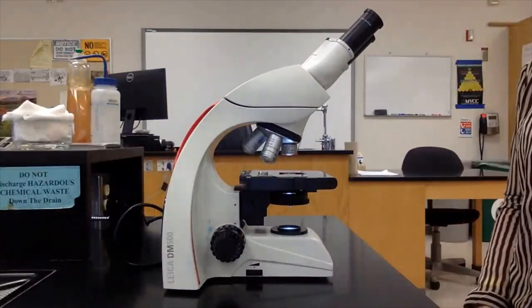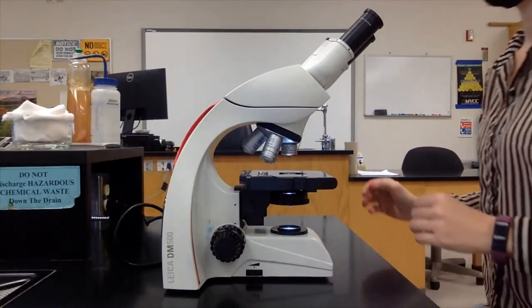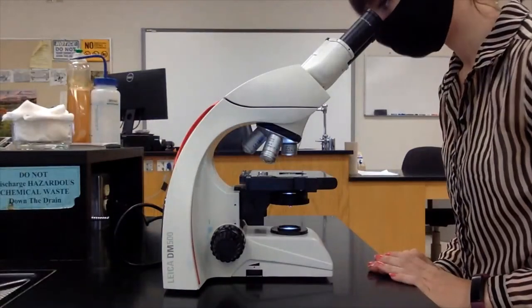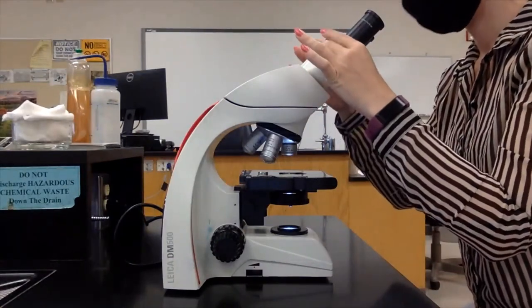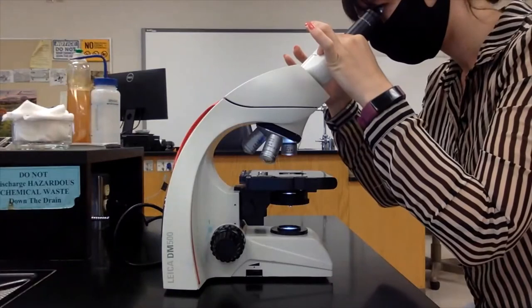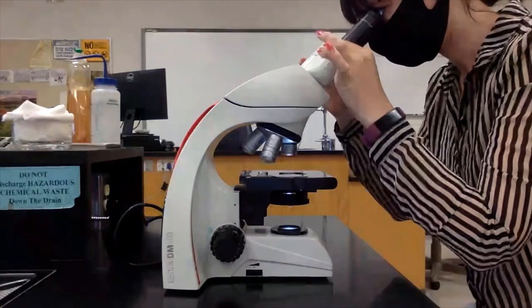When you put your eyes to the ocular lenses, you may only be able to see through one lens at a time. This is because you do not have the microscope set at the correct interpupillary distance for you.